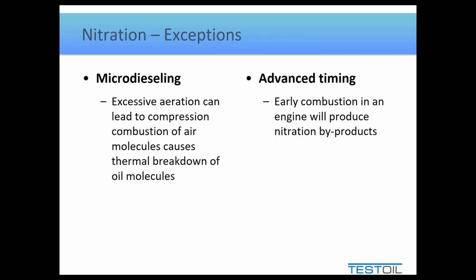But what you will see is through the dieseling of little micro bubbles of air, the oil surrounding that micro bubble will be combusted or cooked at least. And this causes a rapid darkening of the fluid and creates some of these nitration-like deposits.